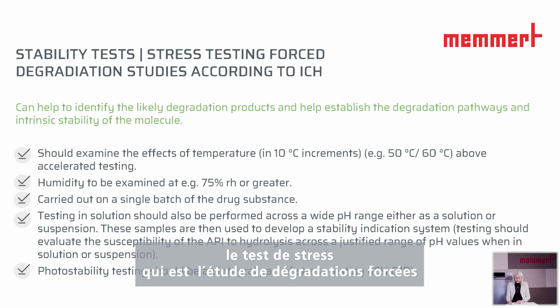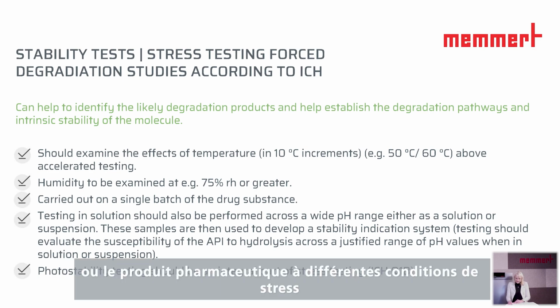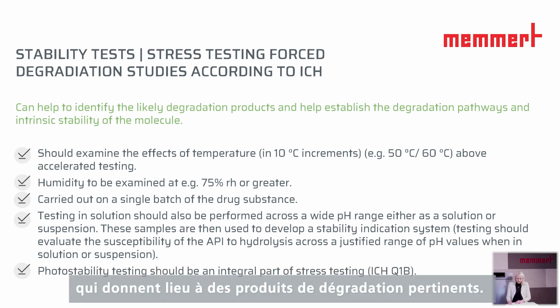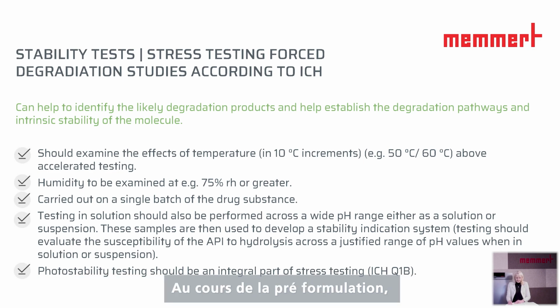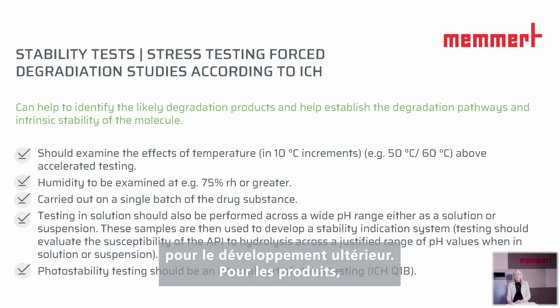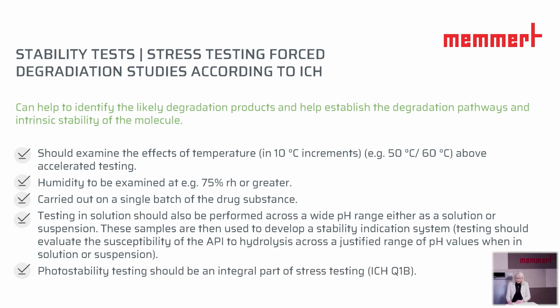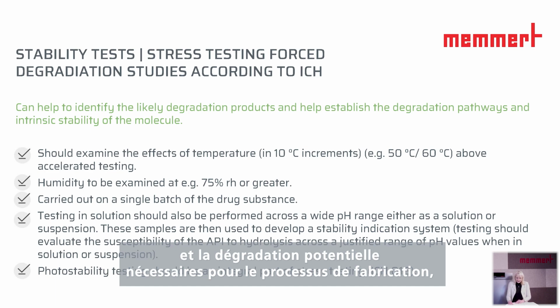a forced degradation study. The forced degradation study is an exposure of the drug substance or drug product to different stress conditions, which results in relevant degradation products. During the pre-formulation, it supports the selection of the compounds and excipients for the further development. And for products, it provides information on the degradation mechanism and the potential degradation necessary for the manufacturing process and also for the packaging.